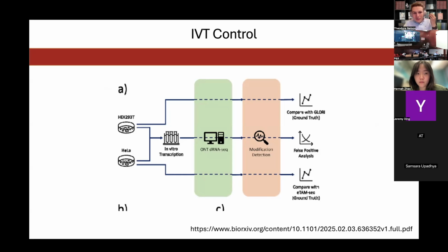So how do you ideally control for false positives in these nanopore direct RNA sequencing analyses? And what we were very lucky with was that about a month ago, somebody published a preprint.